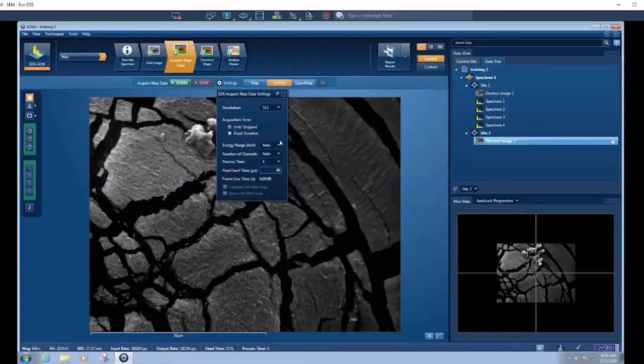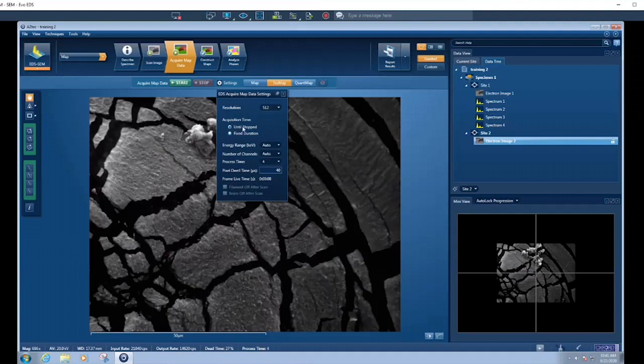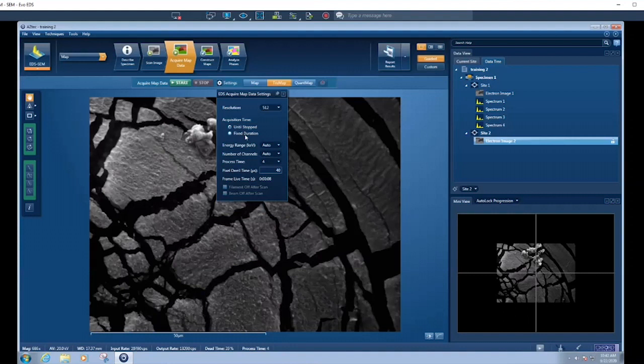As for the EDS settings for mapping, we can change our resolution based on whether we want more spatial resolution or whether we want more signal. We can choose how we want to acquire the signal. Do we want to keep acquiring it until we choose to stop it, or do we want to do it for a fixed number of frames? I always go until I want to stop it because then I can look at the spectrum and see how much signal I've got and just stop it when I'm happy with the amount of signal. But if you're trying to do a hundred samples, lots of samples, you want to keep them all consistent, then you can do a fixed duration.